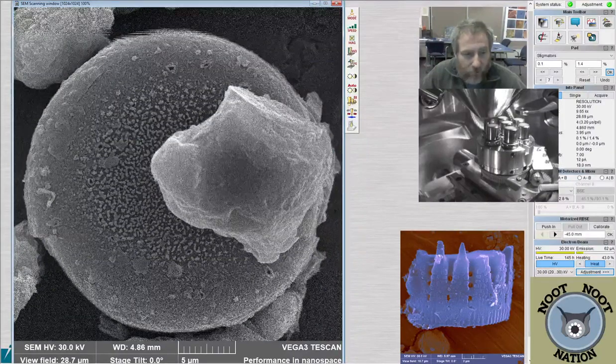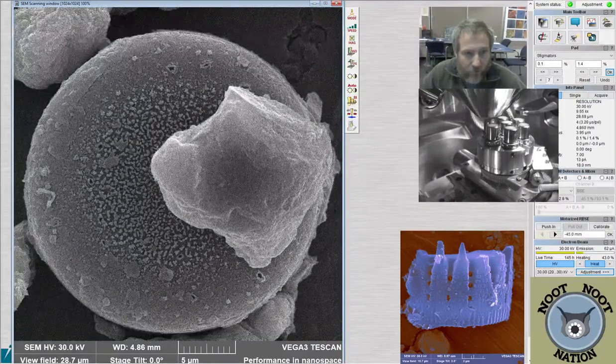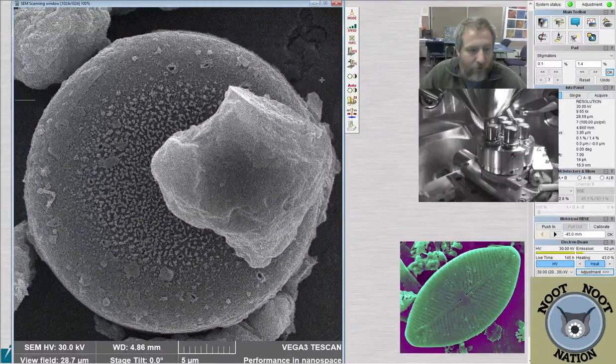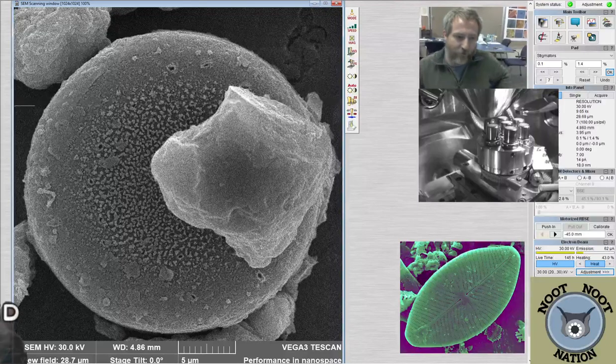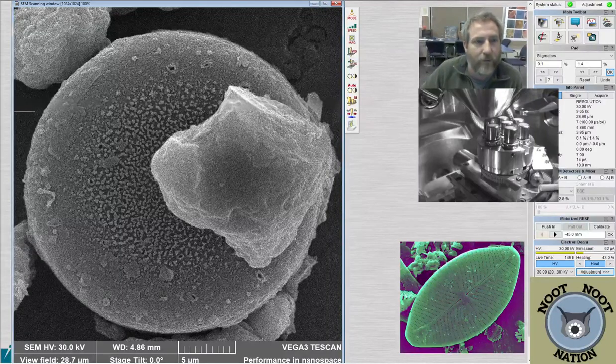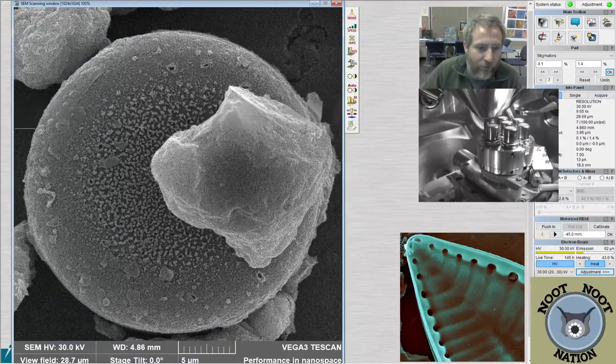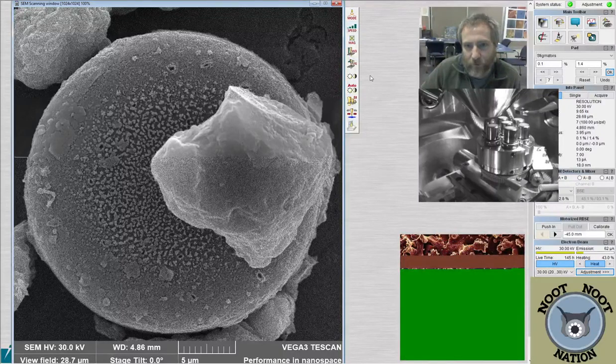In the light microscope, Melosira varians is super boring. It just looks like a pill capsule, basically. In the scanning electron microscope, it actually is pretty dynamic looking. This sort of popcorn structure on a valve face, and then all these little openings or holes that you can see. It's a lot of clay on the outside margin, but I still sort of like this image, despite the fact that we have a giant boulder on it.